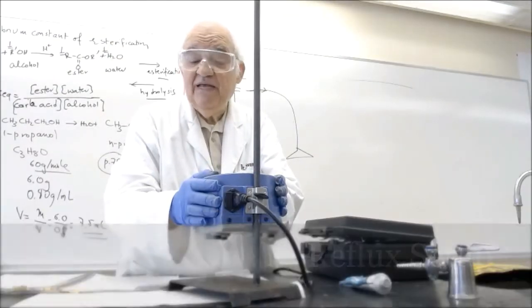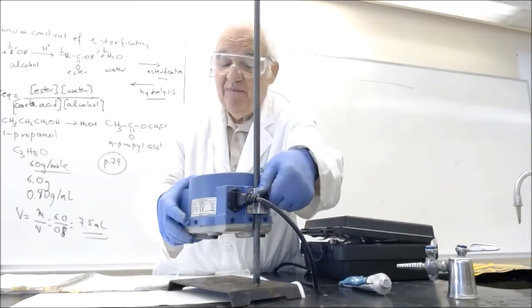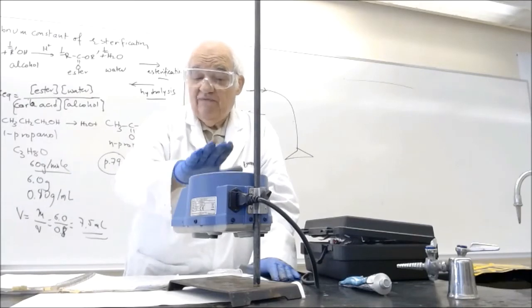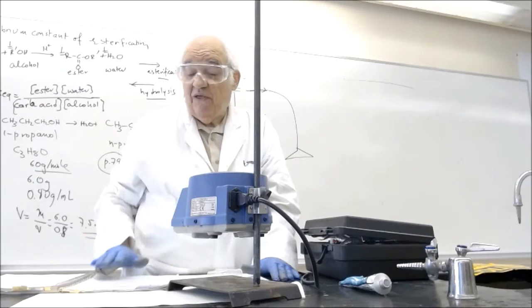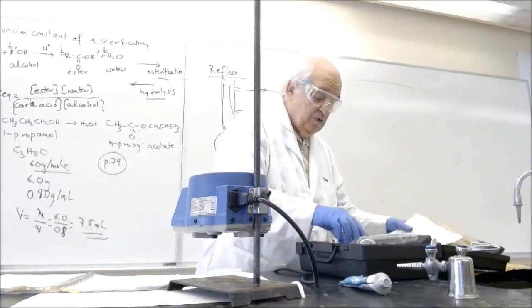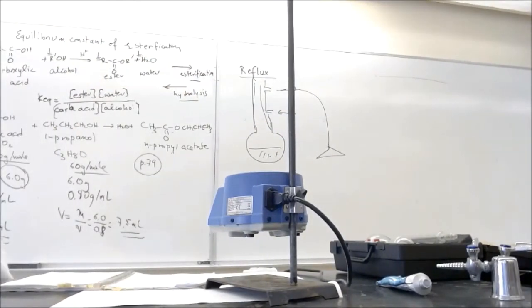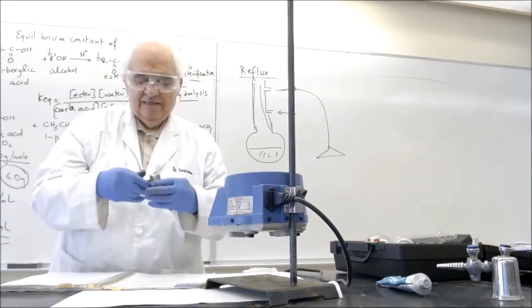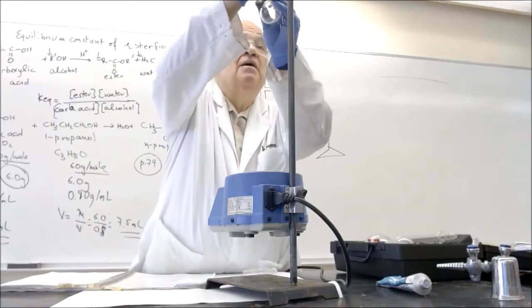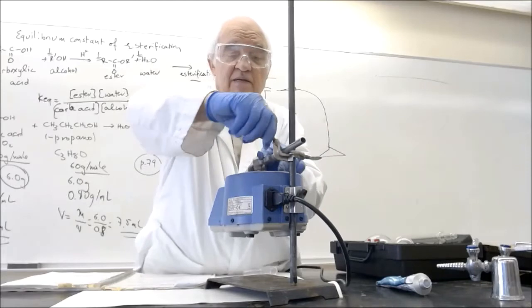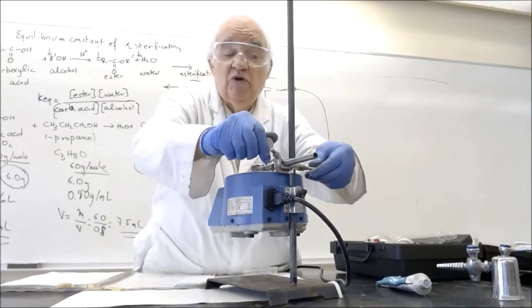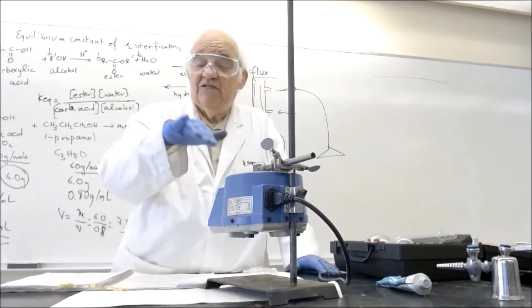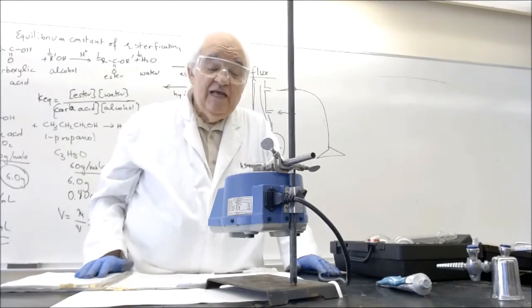So let's try to set it up. Okay, so let's set up the reaction. We have a heating mantle here. Notice that we always, again, have to clamp it pretty tight because all the glassware is going to be on top. And eventually when we want to stop the reaction, what we do is we have to bring this down. And if we bring this down and it's not well clamped, the whole thing will collapse.